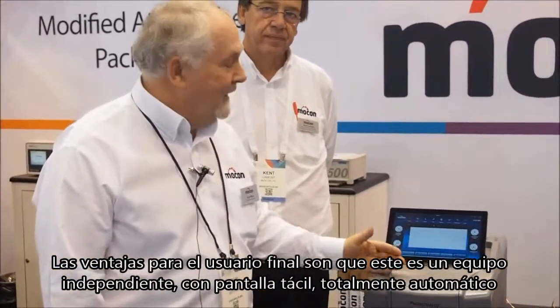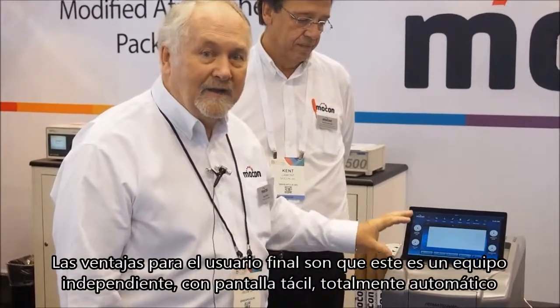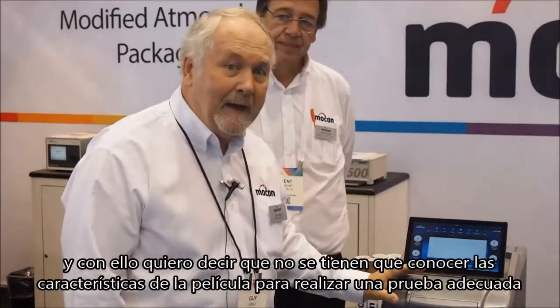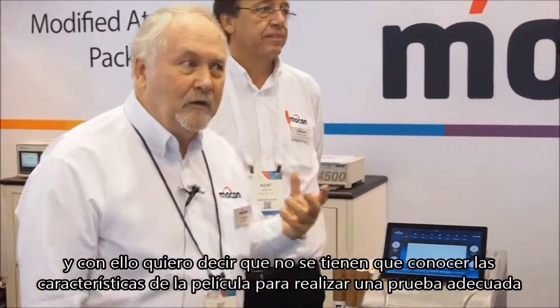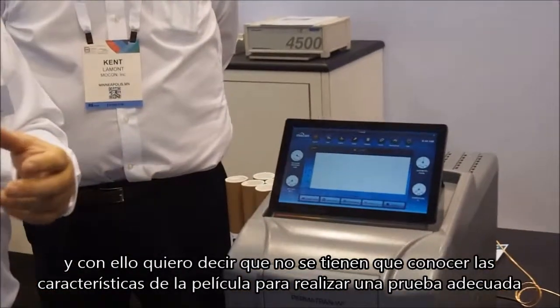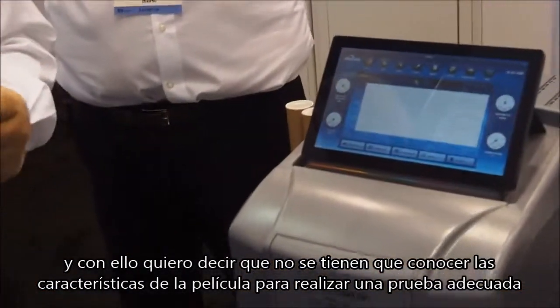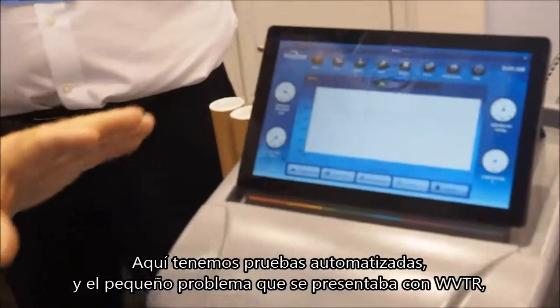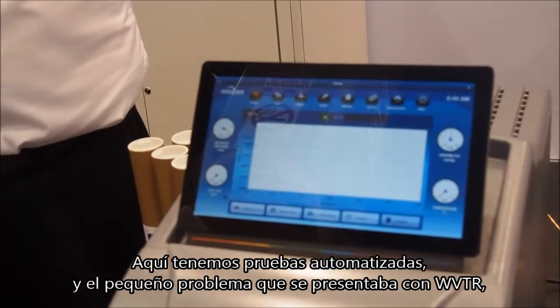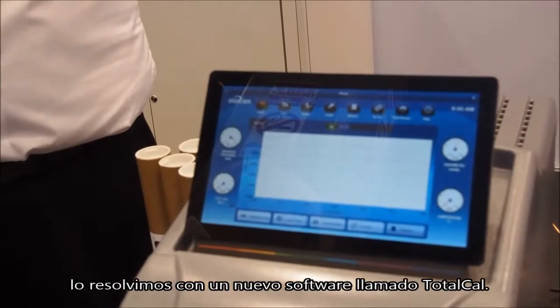The advantages for the end user are that it is a standalone with a touchscreen, it's fully automated — and by that I mean you don't have to know the characteristics of your film in order to get a correct test. We have automated testing on here, and that's been a bit of a problem with WVTR, and we solved that.